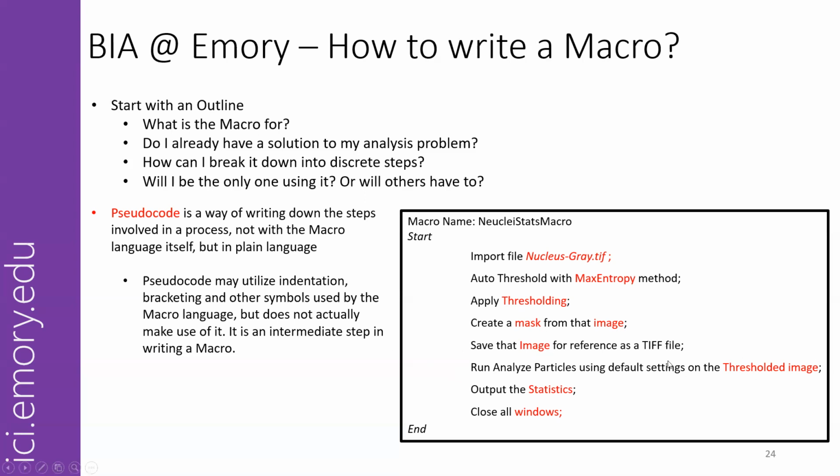and then run a particle analyzer on it. Then output the statistics, save them, and then close all windows. So that starts our macro, that ends our macro. And as we are going through this part today, you'll get a better sense of what we can actually replace this language with.